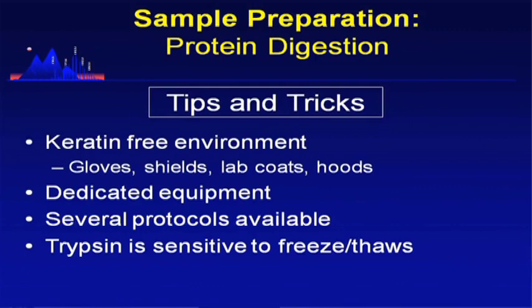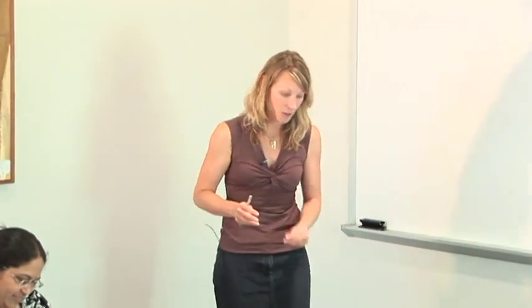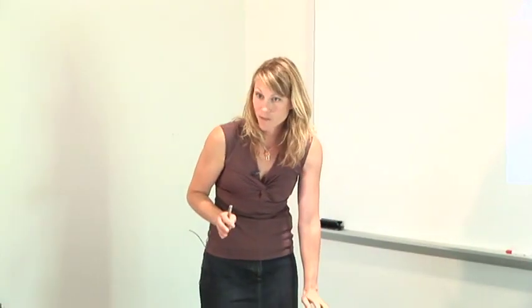So again, dedicated lab equipment. And if you have buffers that you use for digestion, just have those just for digestion, because a lot of times someone else is going to use them, they're going to leave the cap off, and then dust is going to settle in there. So that's all I'm going to say about sample prep. You'll get a lot more in the lab this afternoon. Are there any questions before I go on?